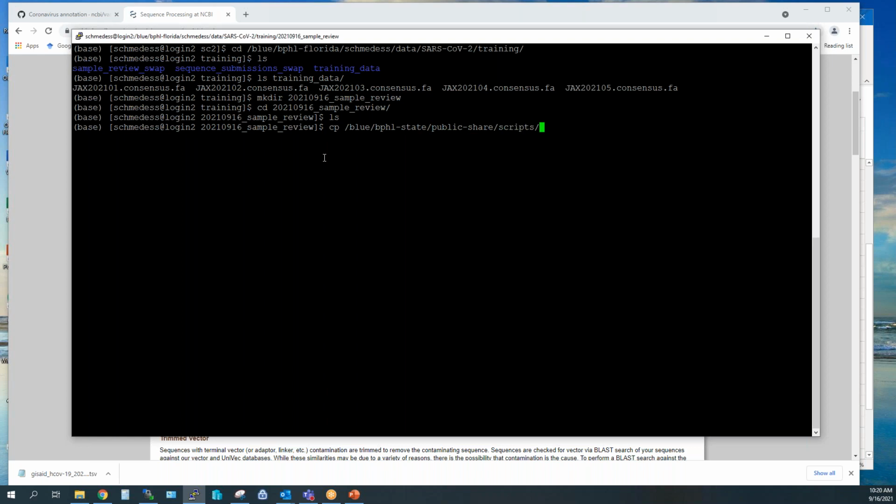You would do that, and then you would start typing in the name of the script. I have them somewhere else. I just want to show you that. They will be in your public share scripts folder, and just copy them into your current folder.